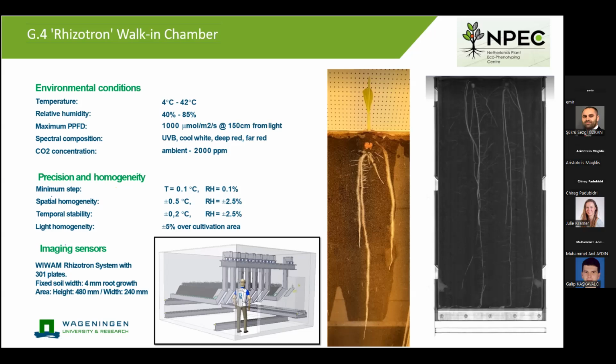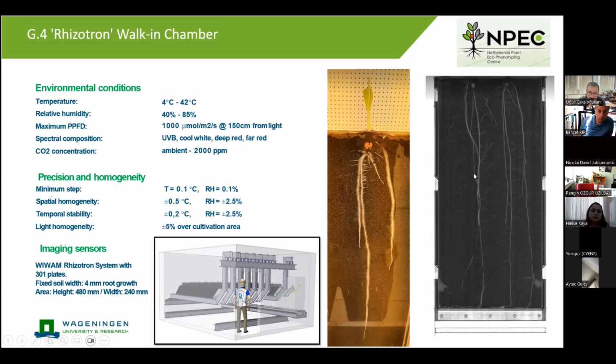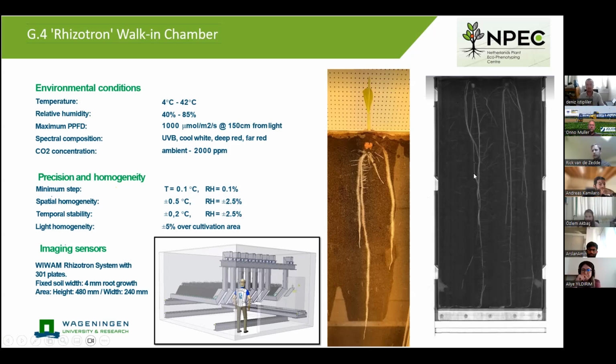Okay. And then we design the system to have as many plates as possible inside one climate chamber to enable us to measure many plates instead of this one example from the X-ray, but more like 300 plates within a few hours without any human interference. But actually the human is the weakest link in the loop.